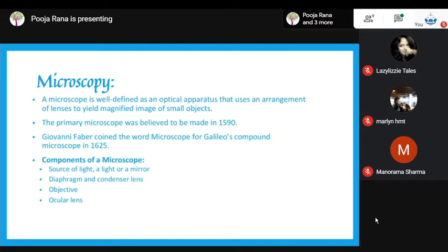This stereo microscope uses a number of mechanisms that gather the light, transmit it and focus it onto a specific path so that a magnified image of the object or sample can be focused within a short distance. This discipline of examining small things using such an instrument is called microscopy. Microscopic means undetectable to the unaided or naked eye, if not assisted by the microscope. And there are numerous types of microscopes, such as the optical microscope.